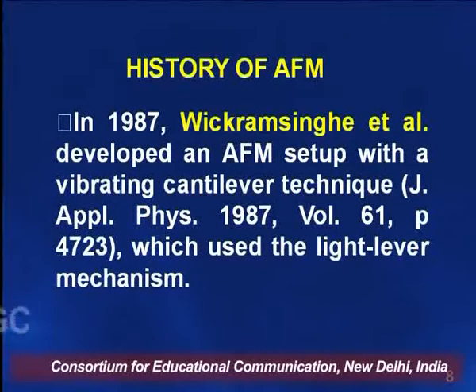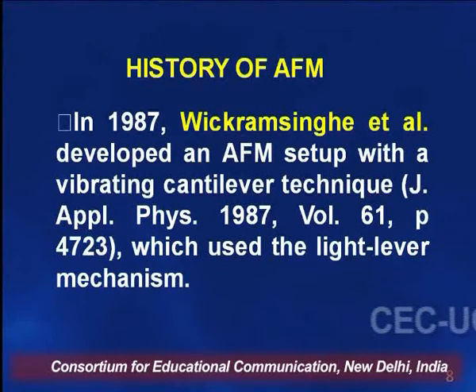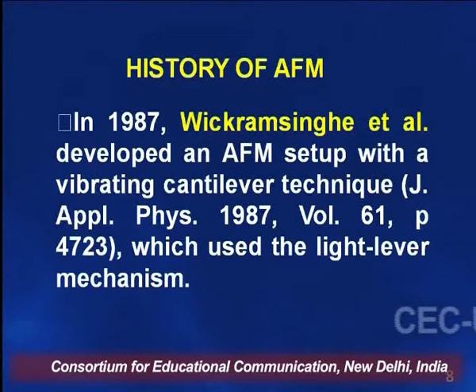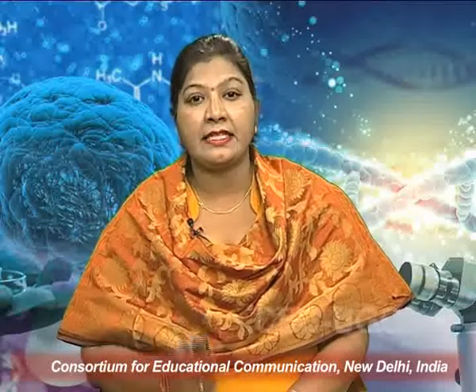But after that, in 1987, the cantilever was explained in the form of a vibrating cantilever. He published the paper in 1987 in Applied Physics, and he described an AFM setup with a vibrating cantilever technique, which uses the light lever mechanism, means this cantilever tip can move or vibrate over the surface of the specimen, and it can give a good imaging and a good picture of the surface.